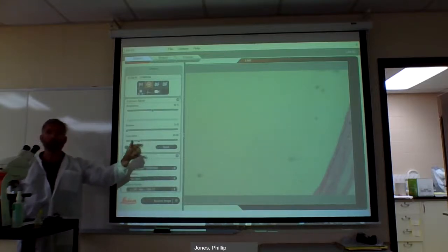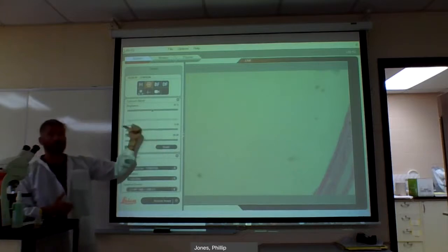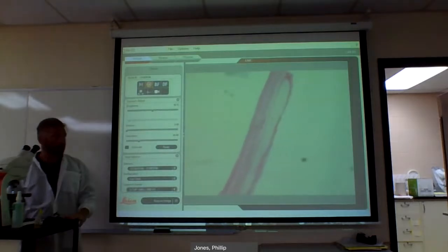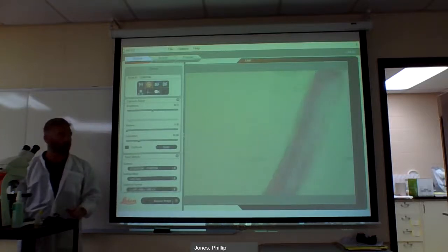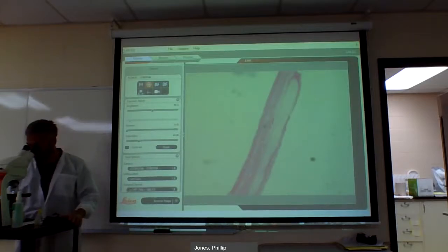I want to move that image toward me. Which way should I move it? I'm literally turning my knob counterclockwise, so my image should go to my left. My image is going right. Remember, I said I'm not going to touch the coarse focus — only the fine.